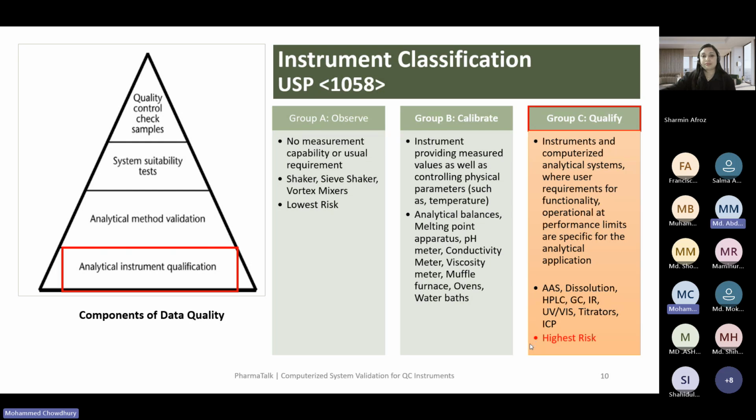So what you need to validate, in simple terms, is that during validation you need to perform your statistical analysis through this software and manually. Then you need to compare both things, whether the software is actually performing the correct statistical analysis or not. And it is critical. Yes, so it's almost a kind of Excel validation.